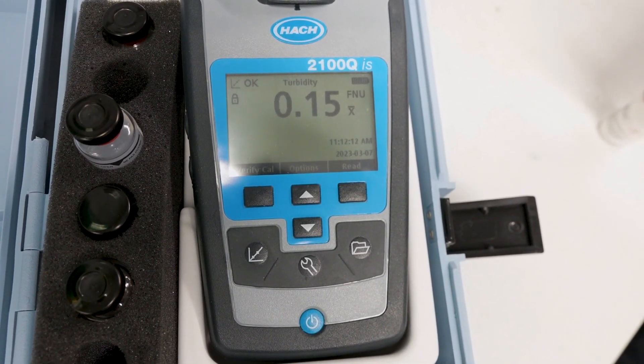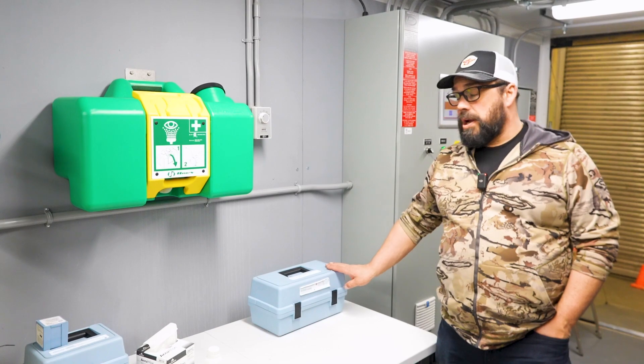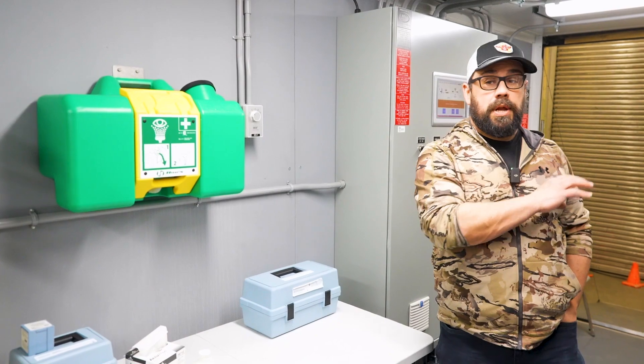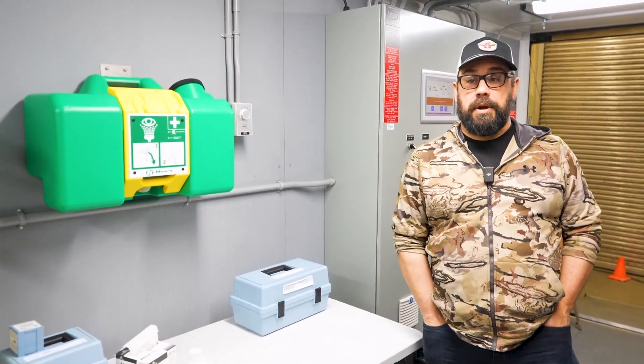You want to make sure you calibrate your handhelds at least once a month, because you're going to use these tools to calibrate your online turbidity meter and chlorine analyzer.